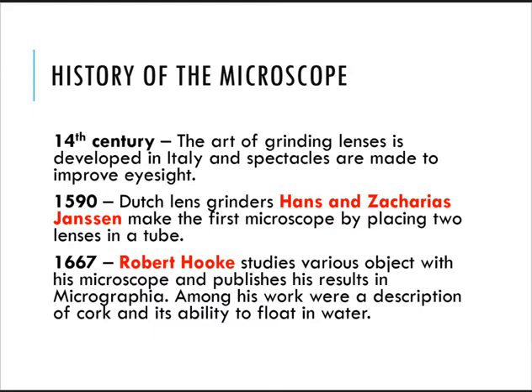Let's talk about the history of your microscope. During the 14th century, the art of grinding lenses was developed in, of course, Italy, and spectacles were made to improve eyesight.